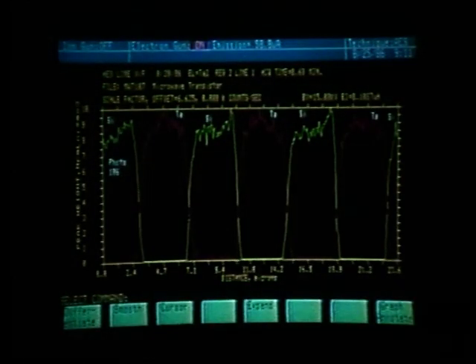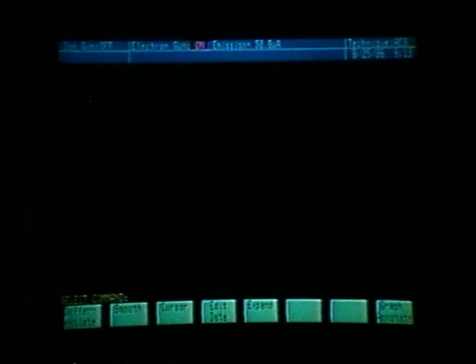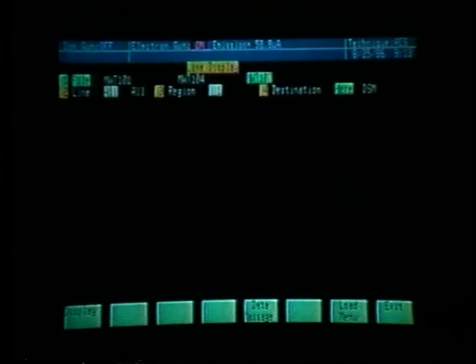Let's now go through the same routine and display the regions for line number 2. Superimpose them. First evaluate if there are any regions we do not want included in the line scan, and obtain a hard copy of that. Let's first clear the screen, Control and clear. We can then return to the line display menu, holding the Shift key, pressing function key number 15. Let's now look at line number 2, so pressing function key number 2 and typing in 2.